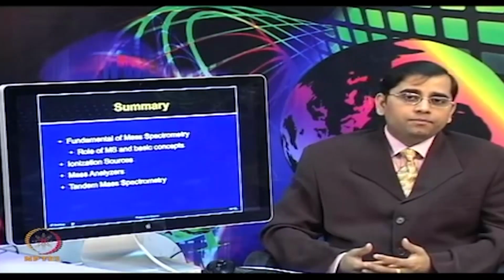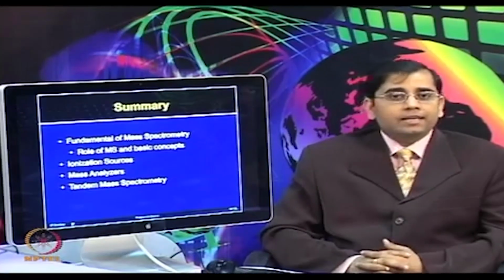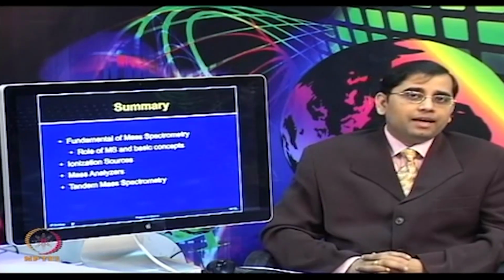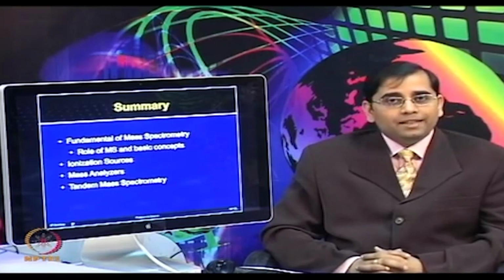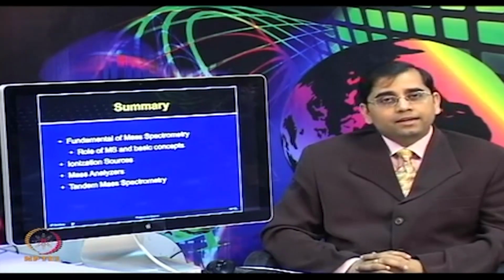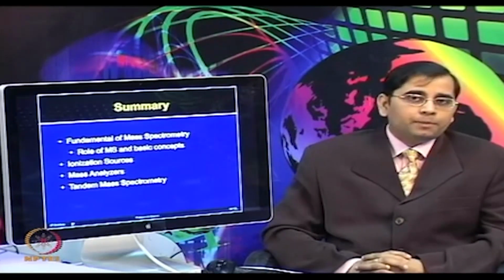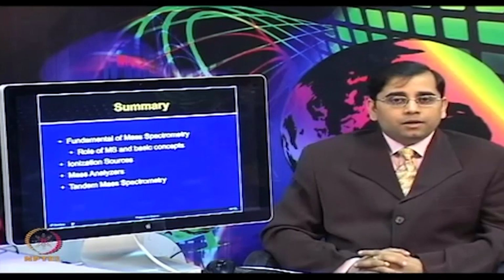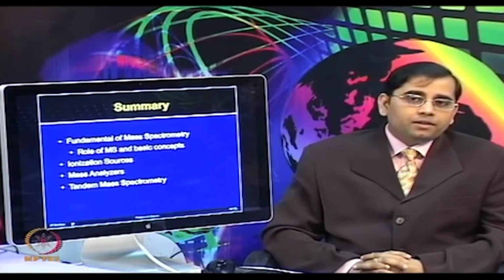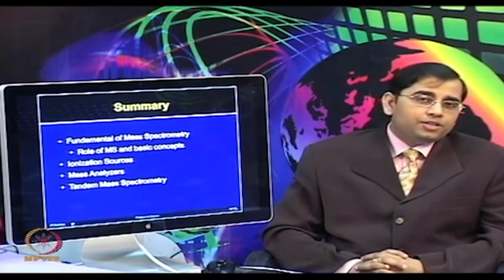It should possess wide mass range, high sensitivity, high resolution, high mass accuracy, true MS and MRM capabilities, wide linear dynamic range, multiple charge separation capability, and polarity switching capability with rapid, complementary ionizations.